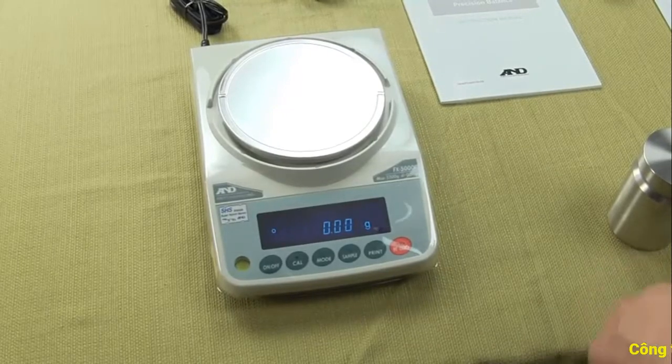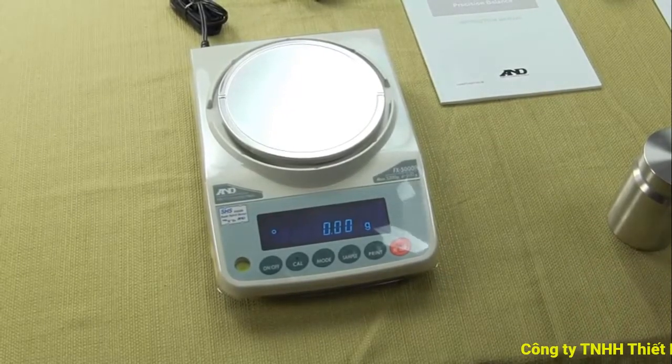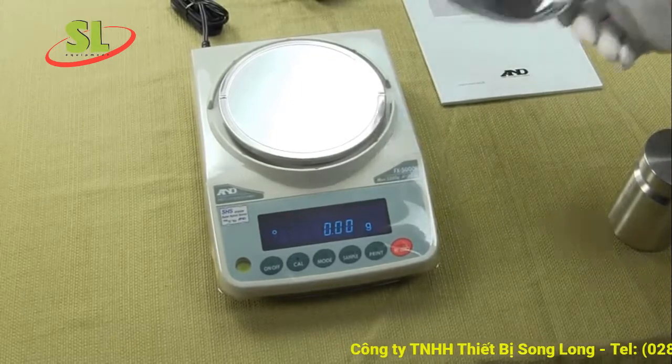Welcome to Precision Weigh-In Balances. Today we're going to be showing you the A&D FX5000i.